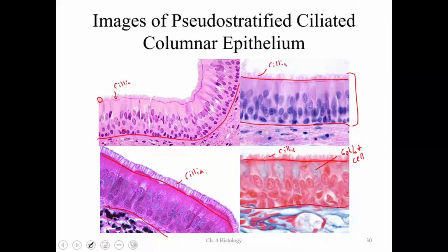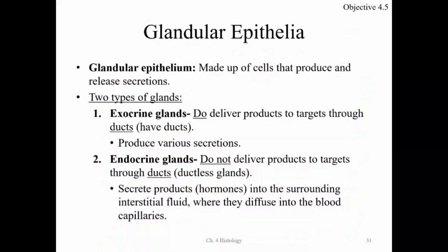But it takes a while to start to see it. As you follow along with me as I draw on it and look at it, it will take various times before you can really see what I'm showing you. So it takes about 8 times.